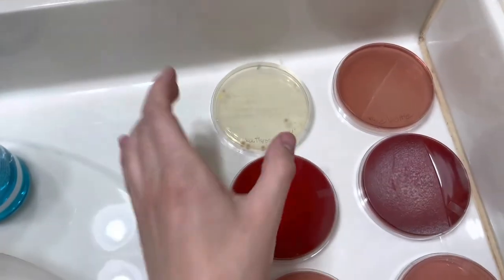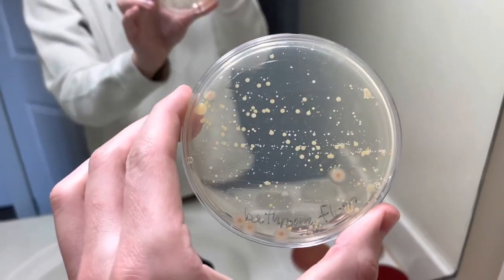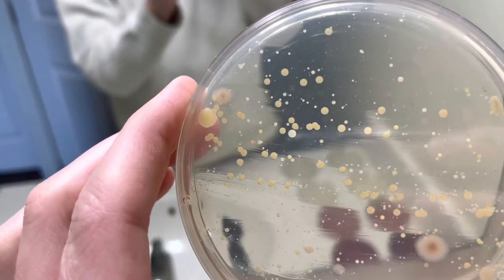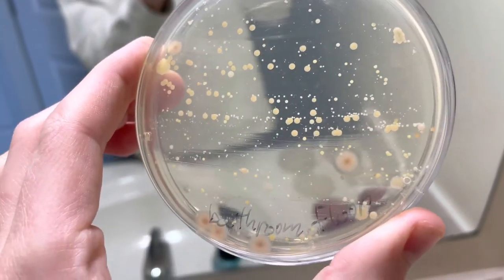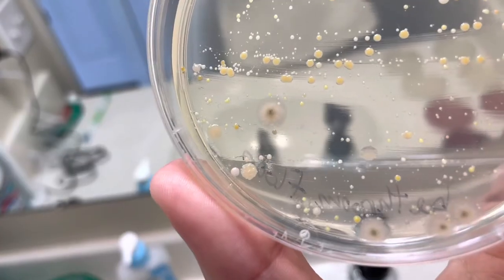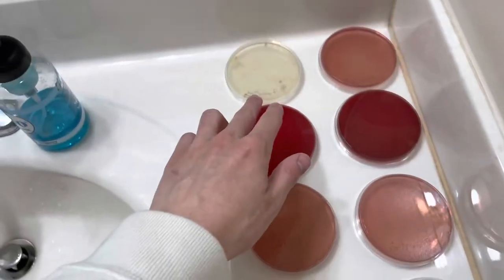Moving on to the bathroom floor — this is a public bathroom floor, right in front of a toilet. Look how disgusting that is. Look at how much bacteria grew on that bathroom floor. You can see so many different colonies, different types, different sizes. You can see white, yellow, some more orange. You can definitely see some fungi there — that growth has got that hairy texture. Oh my gosh, the amount of stuff on here. That is absolutely crazy. Cool cluster down there in the bottom. That is just absurd.